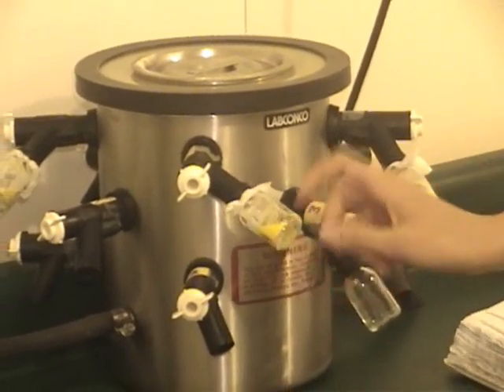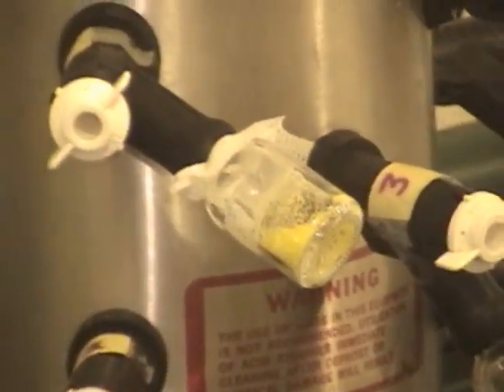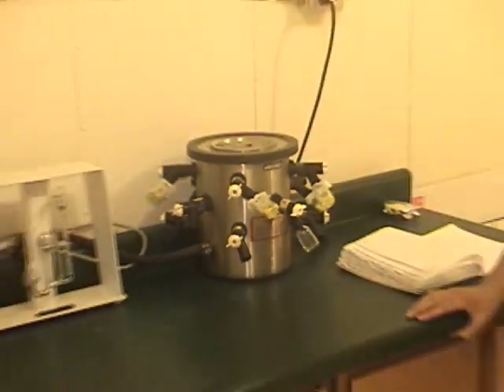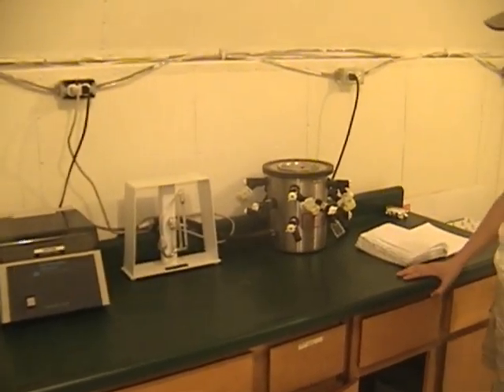The venom becomes like a dry powder, and it's much more stable that way — it can be subject to a wider range of temperatures without degrading. So that's what we do with all of our venom.